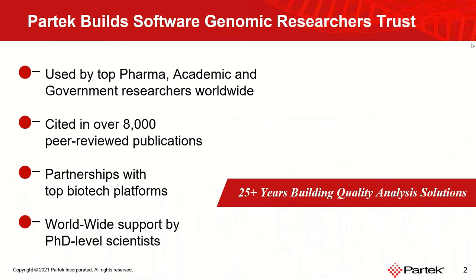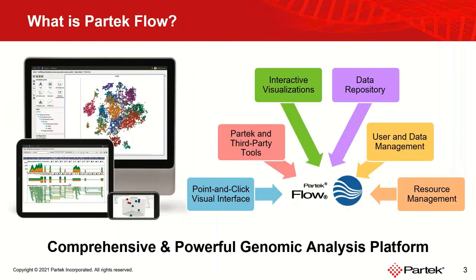So Partek is a software company with more than 25 years of experience in data analysis. Our key product is Partek Flow, a comprehensive and powerful genomic analysis platform. When creating Partek Flow, we had different types of users in mind: biologists, bioinformaticians, and large organizations, and we included a wide range of functionalities to meet their respective requirements.